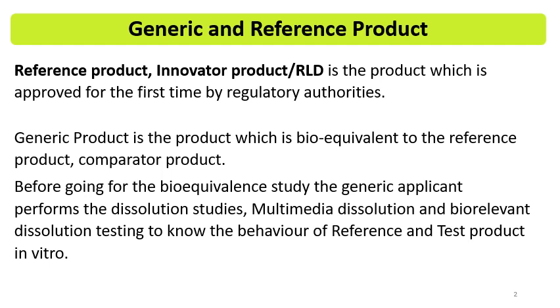The dissolution test is an in vitro test, and it can guide the generic applicant in selecting batches for the pivotal or pilot bioequivalence study, and in understanding the potential differences between the two formulations, so the dissolution test becomes very crucial.